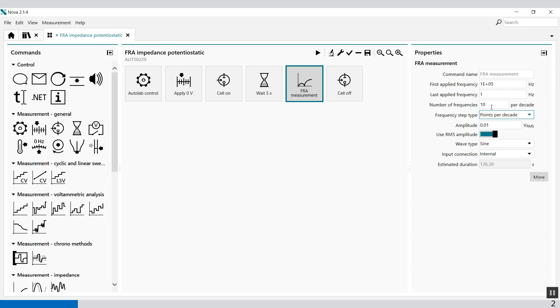Normally it's points per decade. Then we can set to, let's say, four points per decade, and it will take 52 seconds.